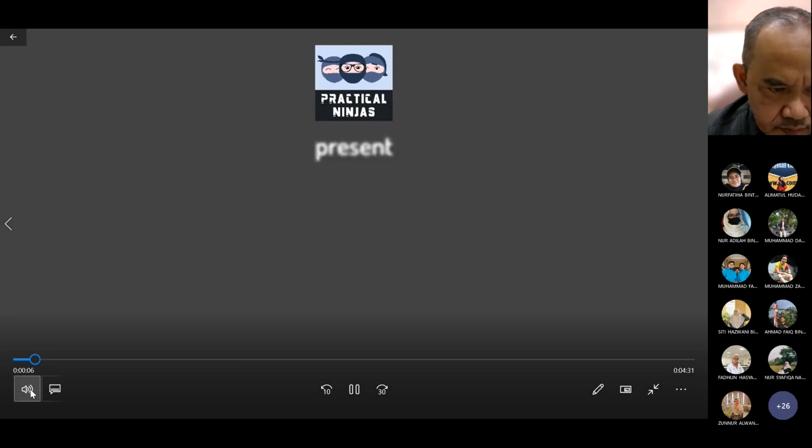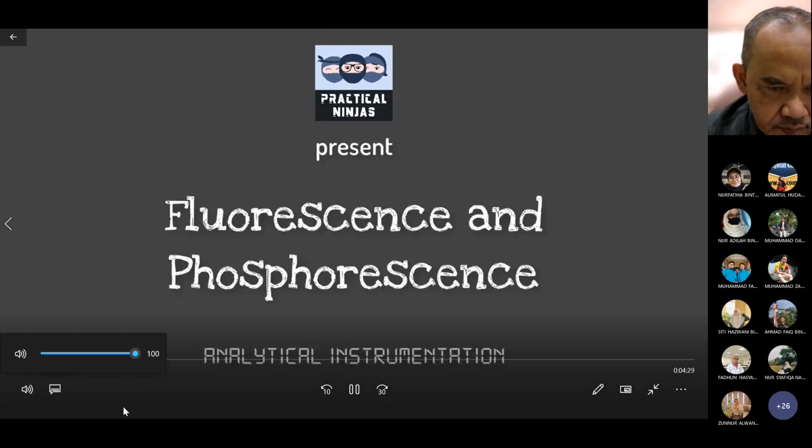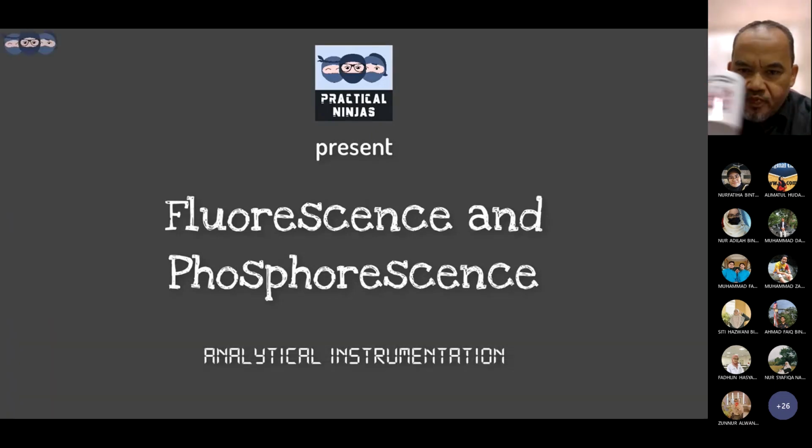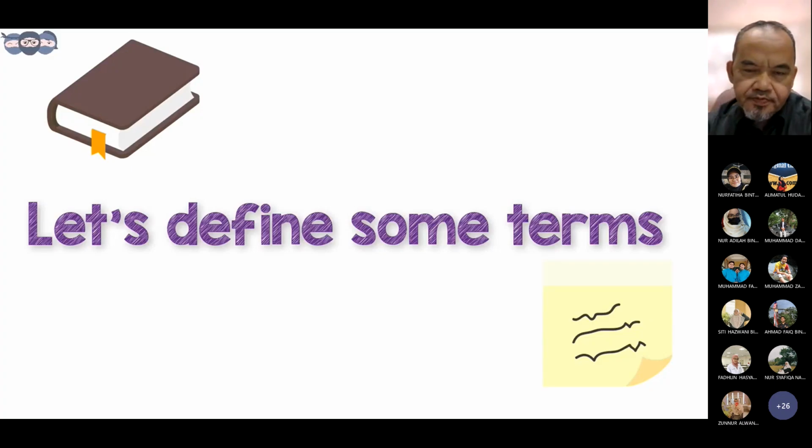Welcome viewers to yet another video on analytical instrumentation. In the current video, we will be going through the basics of fluorescence and phosphorescence. So before starting with the basics, let us understand some terms.